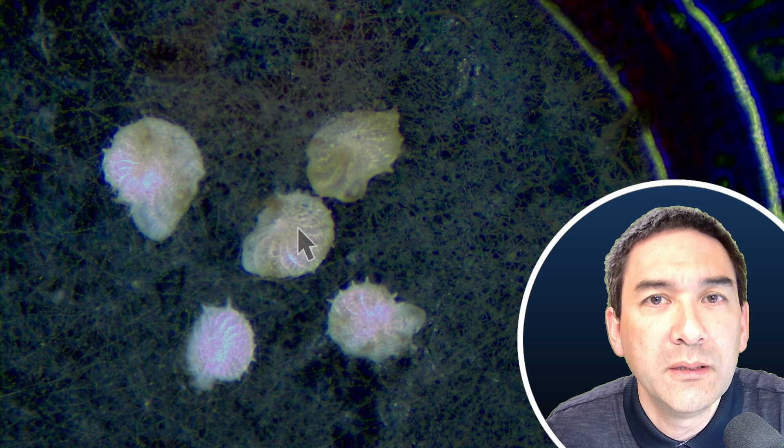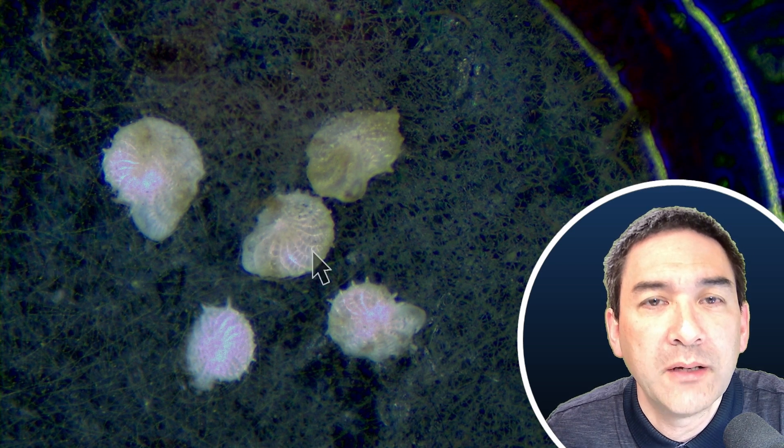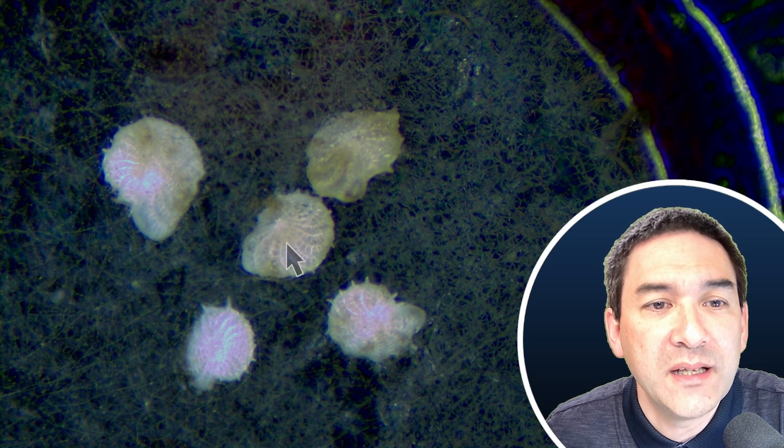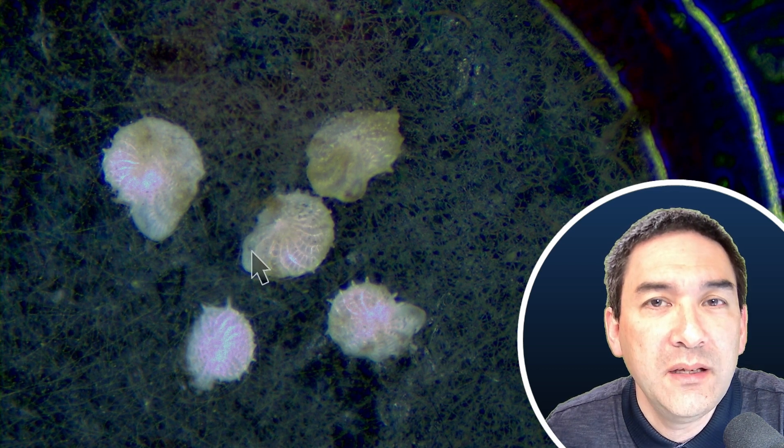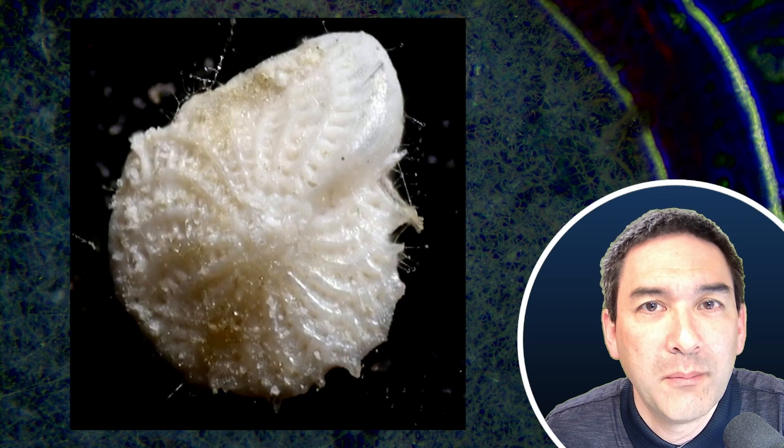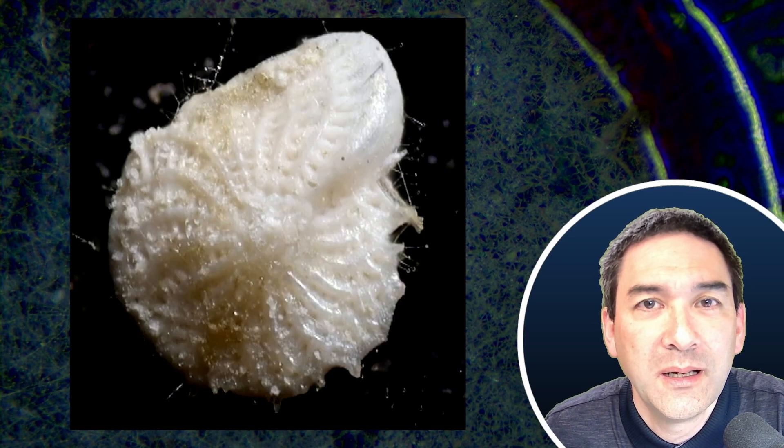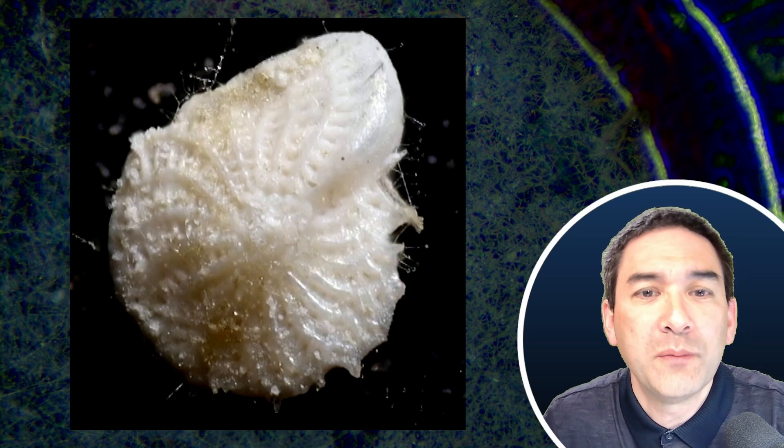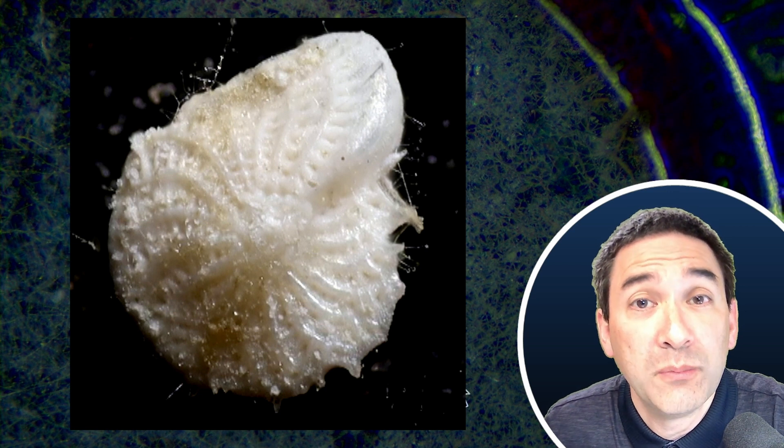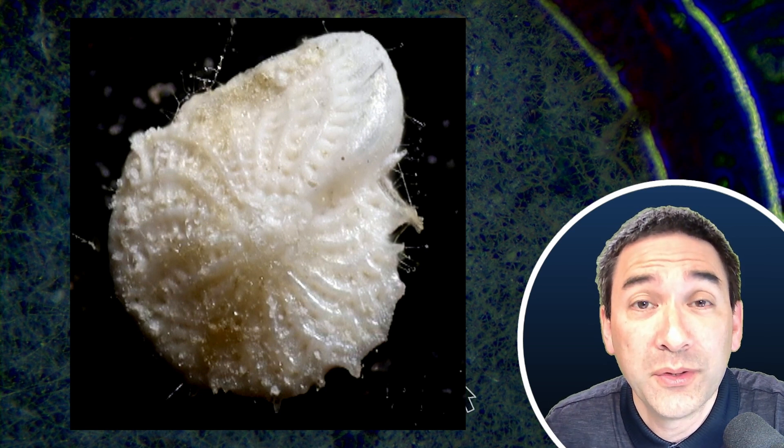And when we look at them, they look a little bit like a spiral shape, almost like snails. But of course, they're not snails. And they have separate chambers in here, tiny little chambers. And what they contain is a single-celled microorganism, a single-celled protist. So those forams can be found also in sand, for example. Some sand samples contain them.